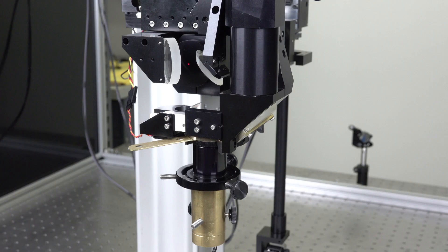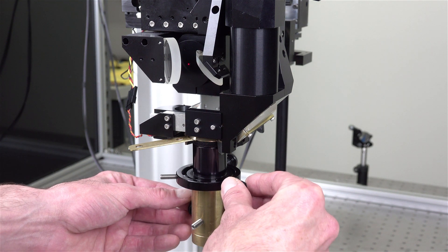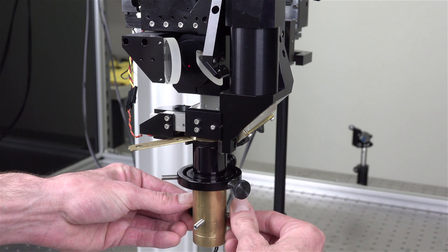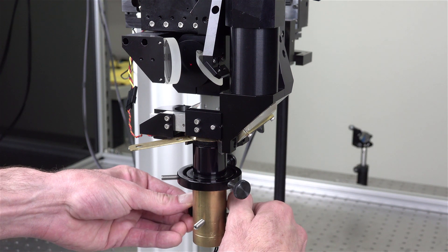Step 4: Use both the translational adjustment, the top thumb screws, as well as the angular adjustment, the bottom thumb screws, to guide the laser beam through the pinholes.